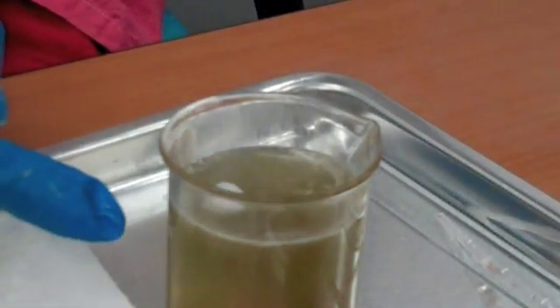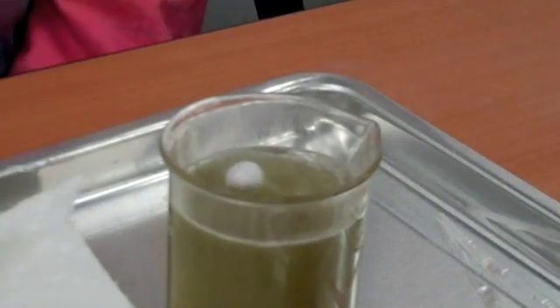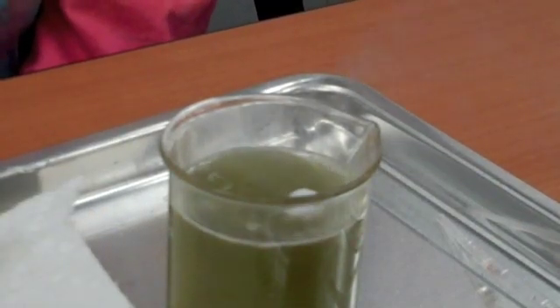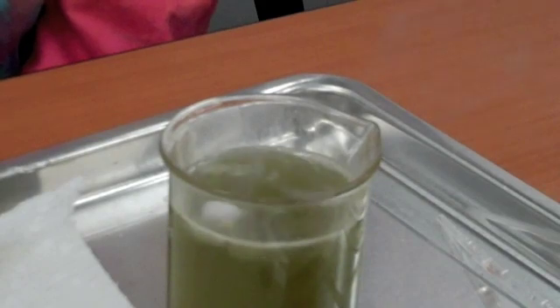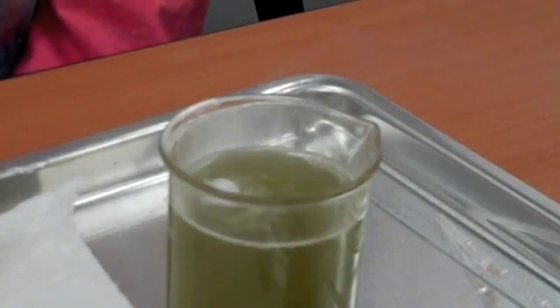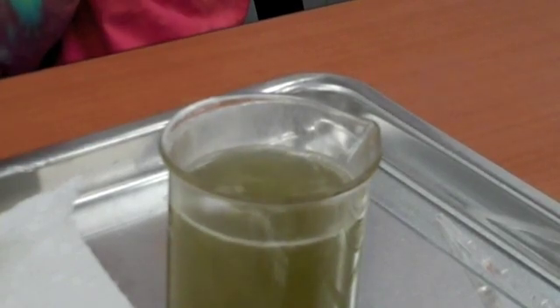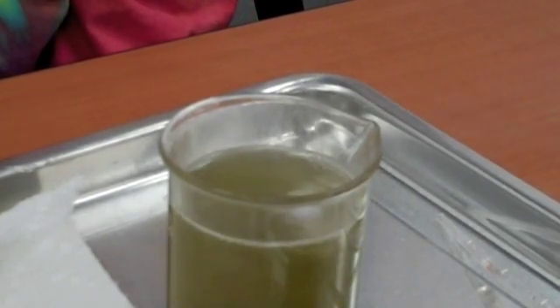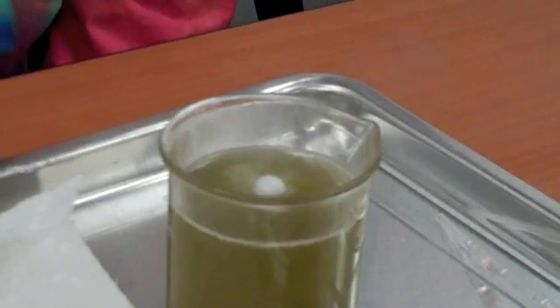You can see that it's turning green because it's turning it into a base, excuse me, the opposite of an acid. And it's getting the sodium so hot that it's melting a little bit and turning spherical.